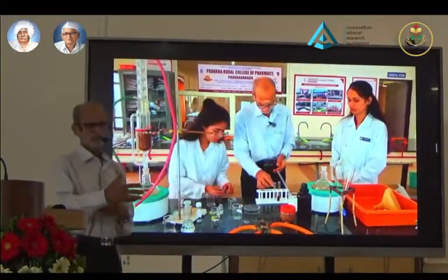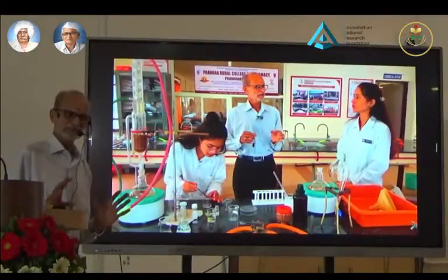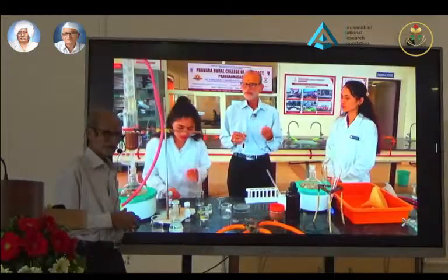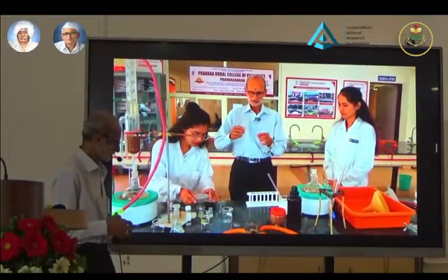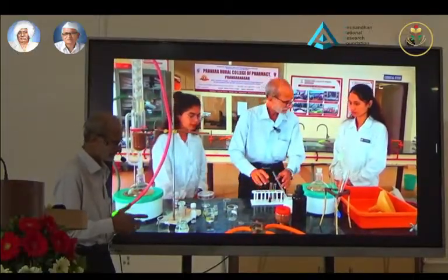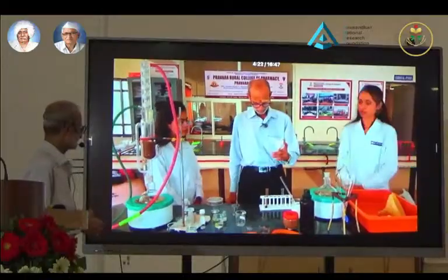You can manage with just a 6 centimeter plate. You need not run 8 to 10 centimeters unnecessarily and waste time. Okay, now the TLC has been put up here. Fast forward a little, so we need not waste time.